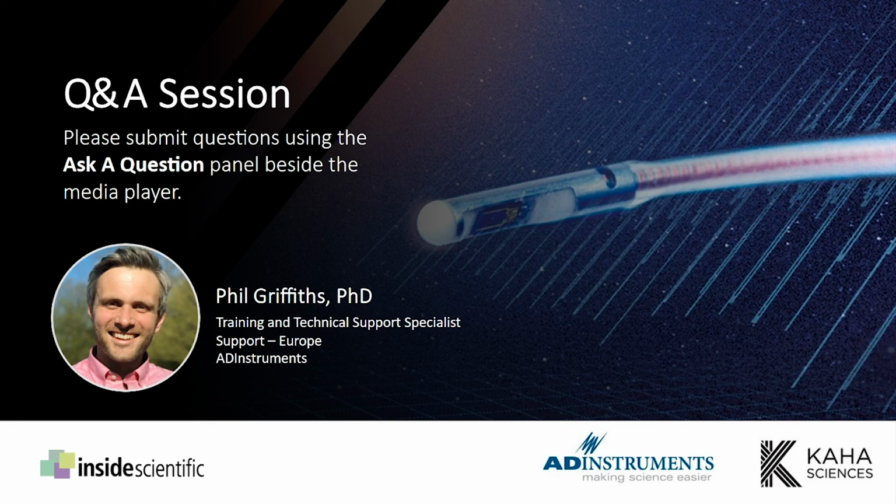That's a good question. In terms of plethysmography, no, I don't think there's anything you can do with these telemeters for that. In terms of respiratory research, you could measure diaphragm or intercostal EMG to look at respiratory activity, and you can also measure intrapleural pressure using the pressure telemeters. But yeah, they're the two main applications that I can think of for respiratory research.